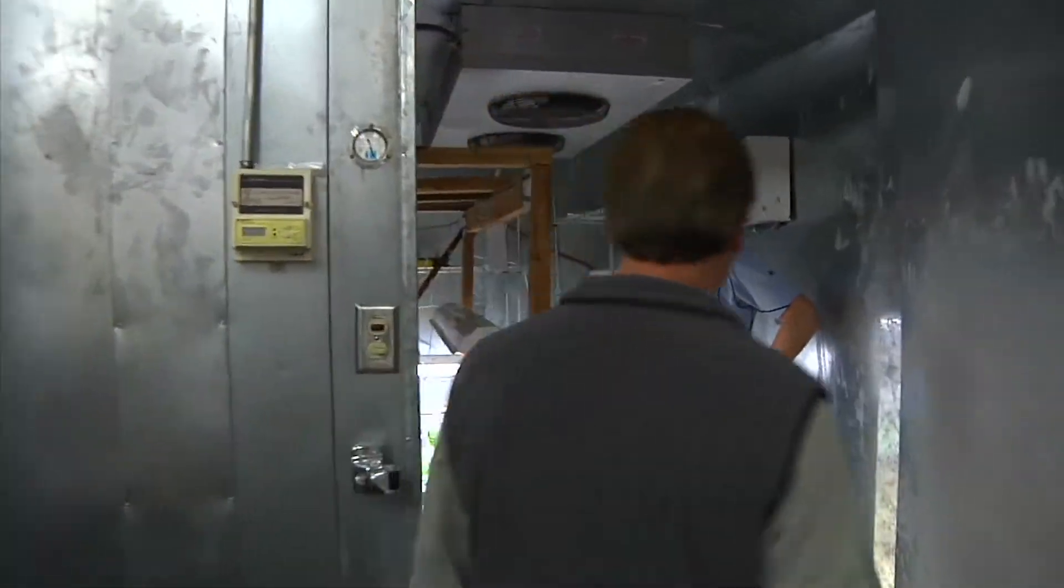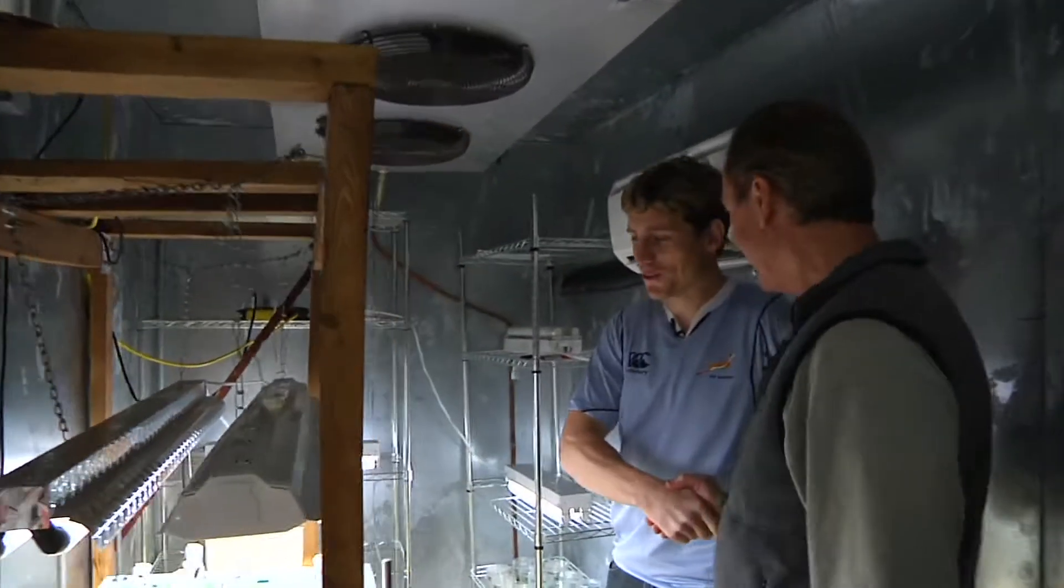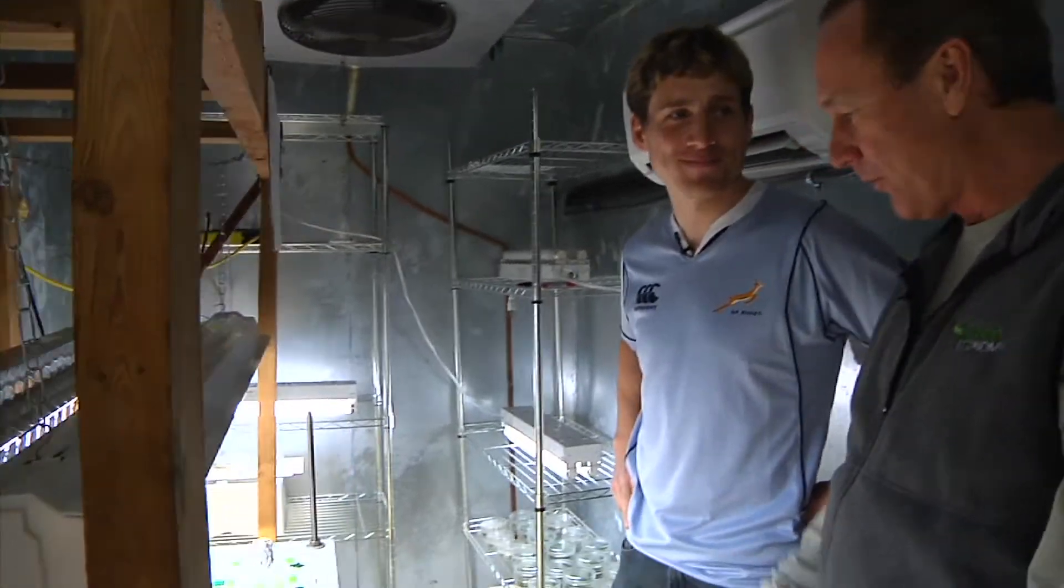Andrew just showed us how simple this whole process is. Let's go see it actually in action. Hey Dave, hi. What are you doing in here? Oh, just checking on my cultures.